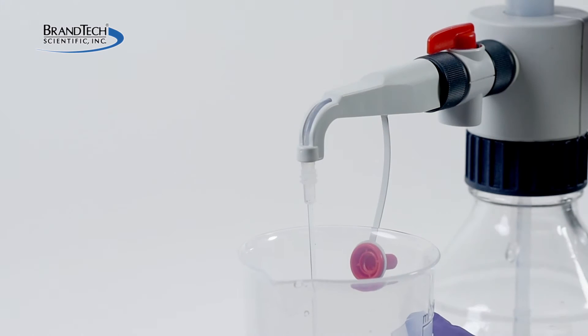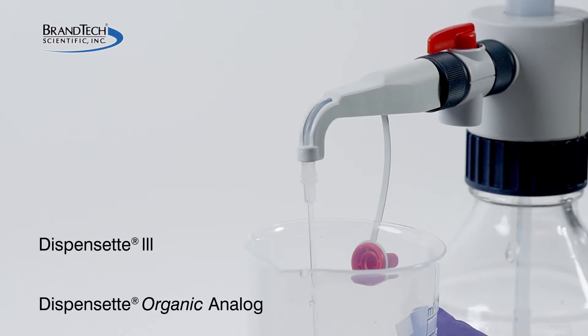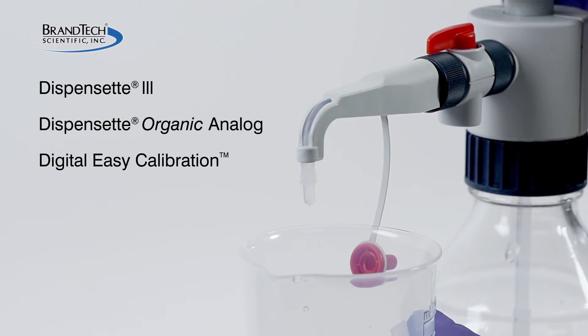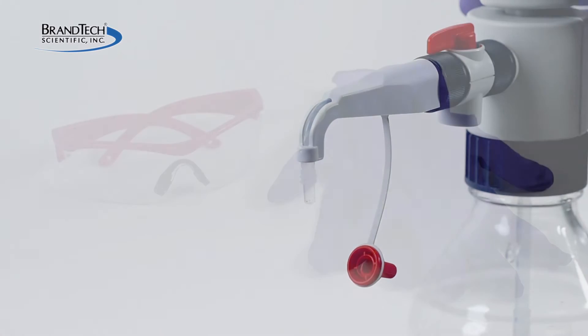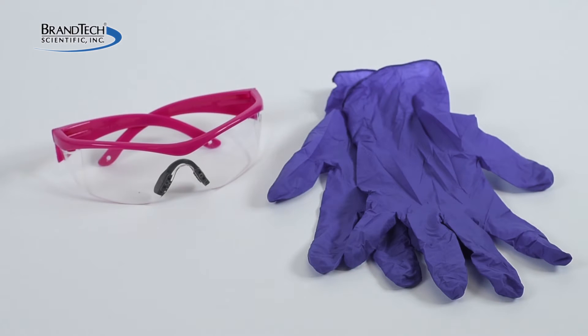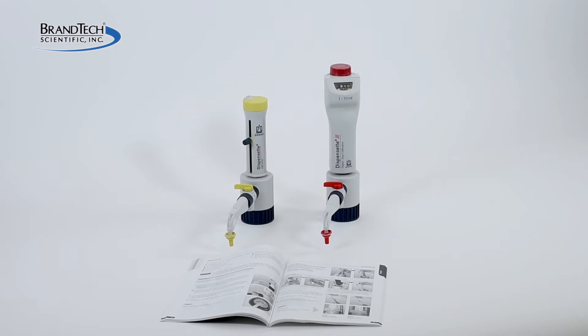This video will show you proper cleaning procedures for the Dispenset 3, Dispenset Organic Analog, and the Digital Easy Calibration versions. Wear the appropriate personal protective gear and observe all necessary safety precautions. Always refer to your operating manual for specific instructions for cleaning and maintaining your particular Dispenset model.